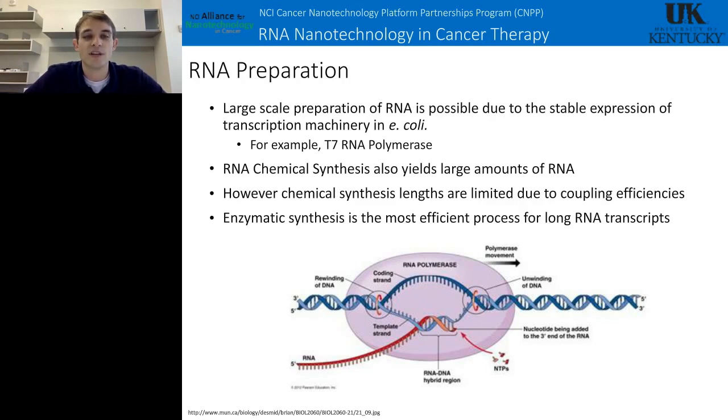However, after the in vitro synthesis, you're not only left with your target RNA strand. You are left with your proteins, you're left with NTPs that do not get incorporated into the RNA, and you're also left with your DNA template. So these all need to be removed from the transcription mixture before the RNA can be used.